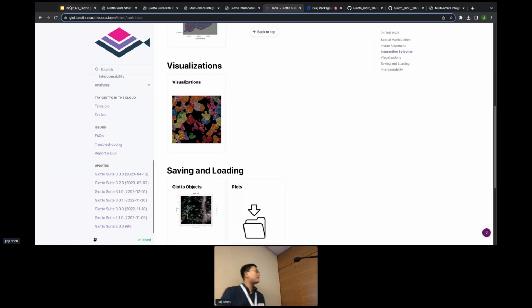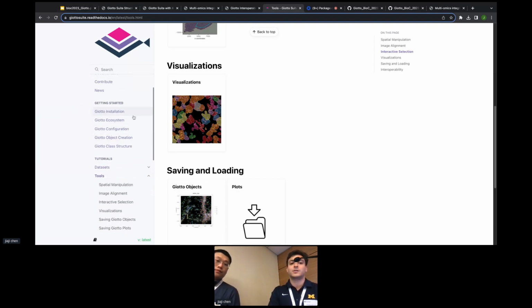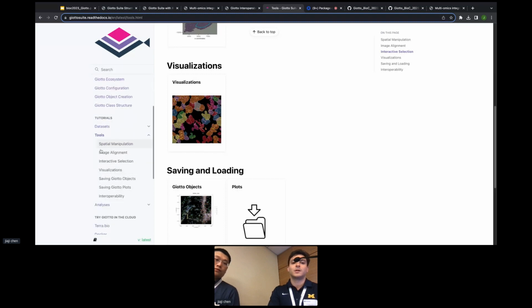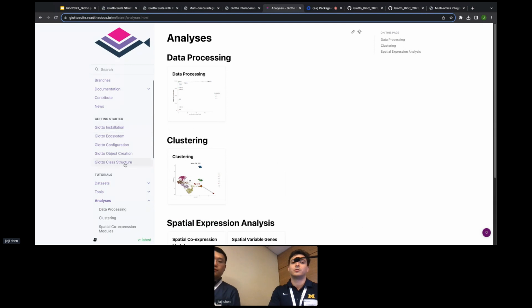Just a quick comment on the website. I'm the newest, or one of the newest members in the Dries lab. So I've been working on this project for about a year. So if any of you are interested in using Giotto, my advice just to get started in the most streamlined way, definitely check out the Get Started section. And then I would look into tools and analyses before stepping into the data sets.